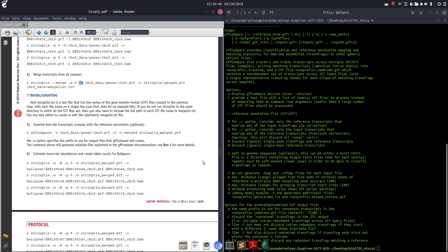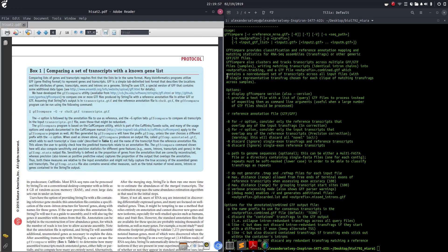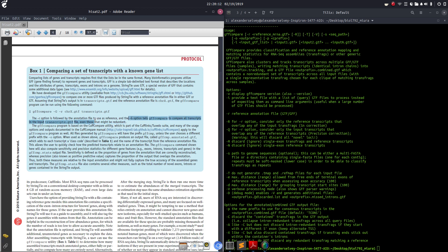Let's see if we can find it in the paper. It says 'see Box 1 for more details'. Scrolling back up to Box 1 - the dash-G option tells gffcompare to compare all transcripts to the input transcripts GTF file. The dash-r is followed by the annotation file to use as a reference.